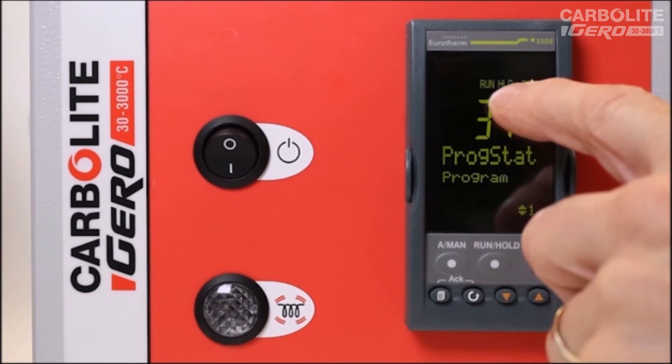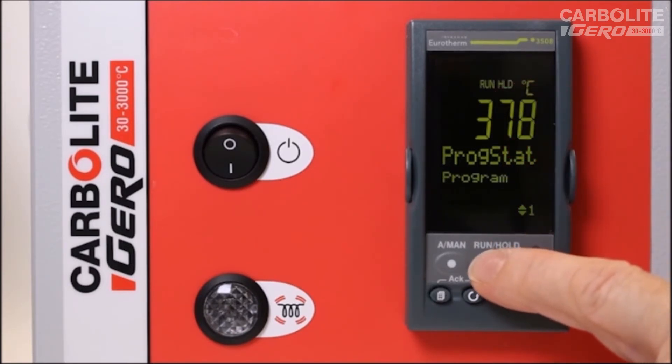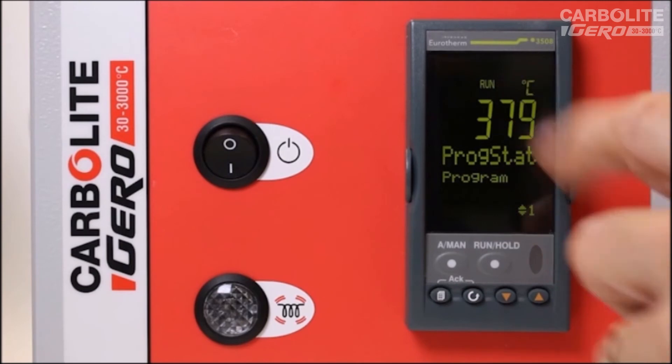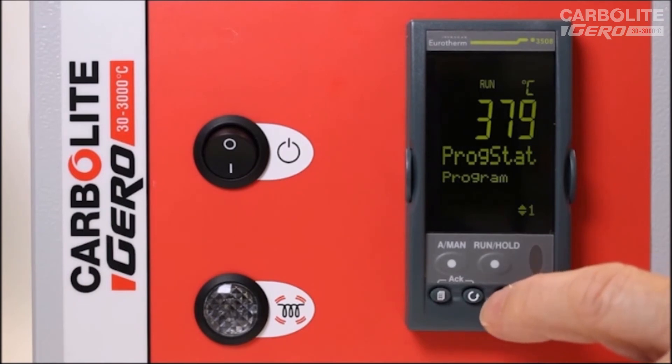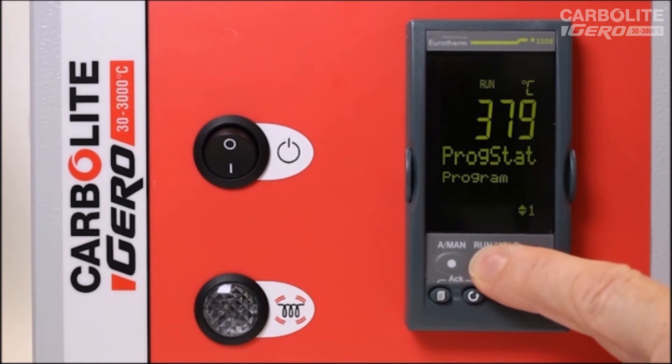We can press this button once more to hold the program. HLD illuminates, showing that the program is being held and has stopped running. We press the button again, the HLD indication goes out, and the program is running again.